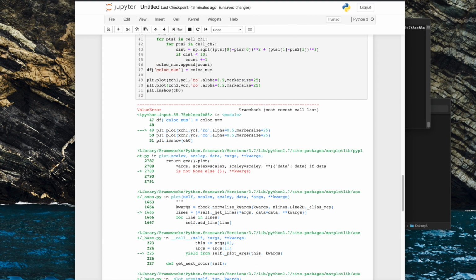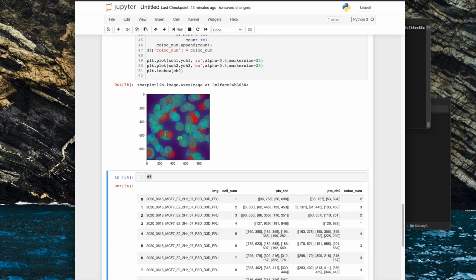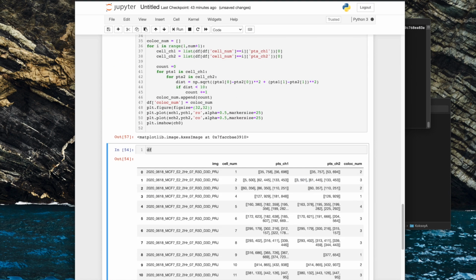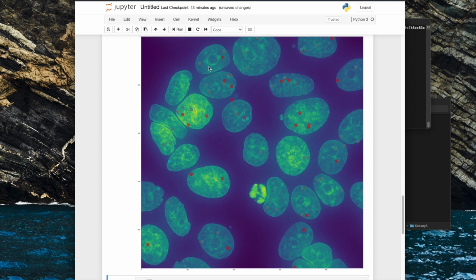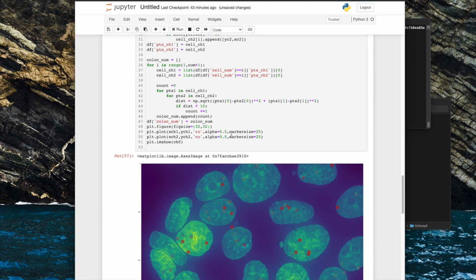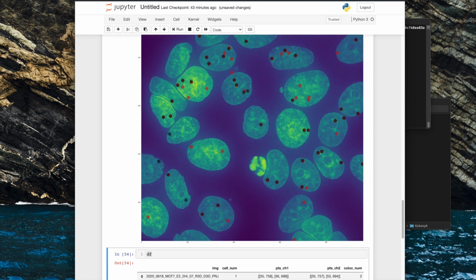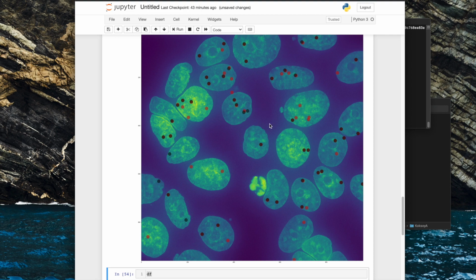Oh wow, what did I do wrong? Oh yeah, okay, I've just forgotten. That's very large, isn't it? But it's because I haven't scaled the figure as well. I'm sure I could set this globally, but it's good practice to type it in. Yeah, so now you can see where the foci are overlapping. Cyan really wasn't a good choice, but maybe we could make that black, if that can be better. Yeah, well, you can kind of see where they're overlapping and where they're not.